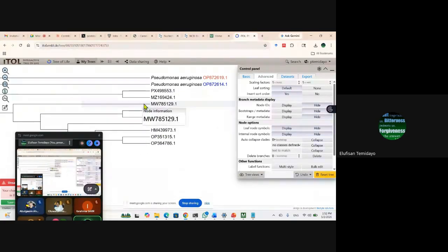Then we can also do so many other things, like maybe if you are going to be talking about the clades, then you can begin to bring the clades together. You can give them a color. Most especially that is done with circular genome map. If I think circular phylogeny and I want to group a group together, you can also use iTOL to be able to do that. I won't be able to recollect that now, but I think I remember I've used that before in the past. So you use it to circle it and say, okay, this particular group belongs to this color. This color is for this particular group, or this color is for this particular clade. We can also do that.